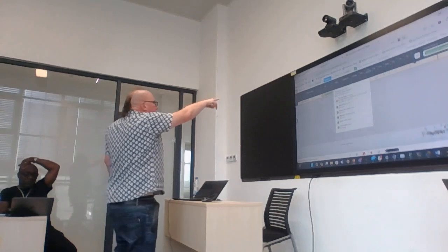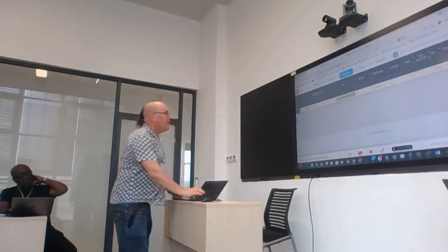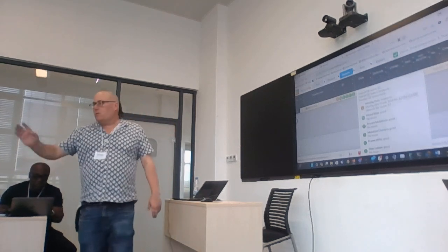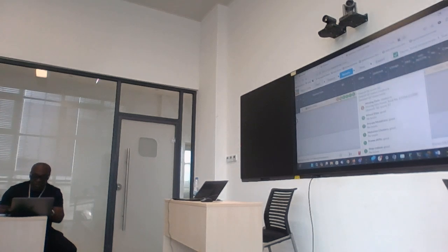The next thing, the M on my screen. M is for mixed sites. Okay? It's mixed. Now, yesterday we said two things can cause a mixed site.